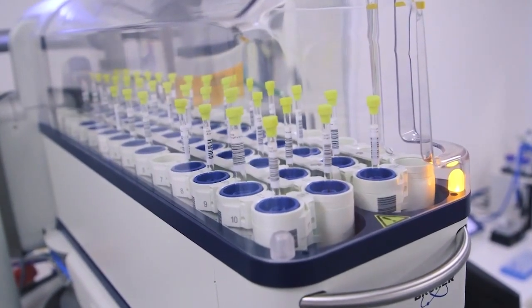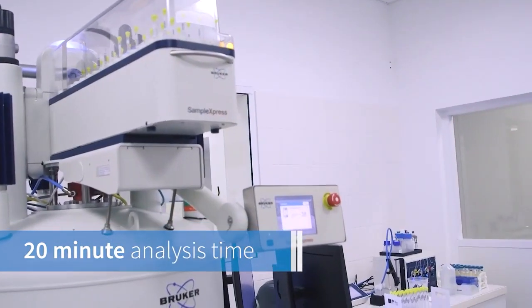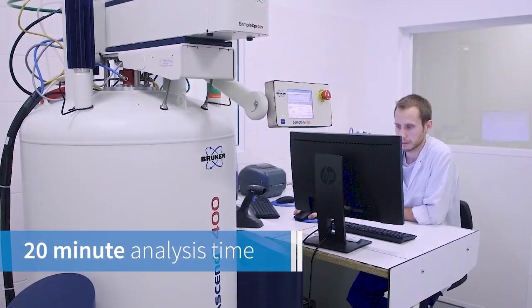The rest of the analysis procedure runs automatically, with no more manual interaction required.